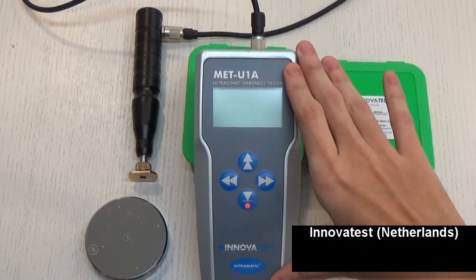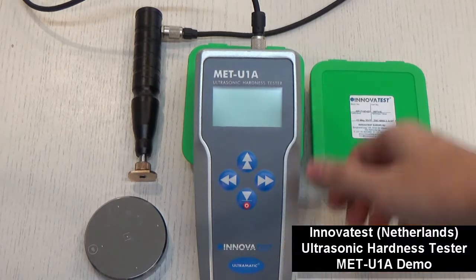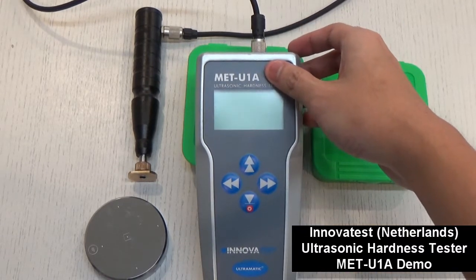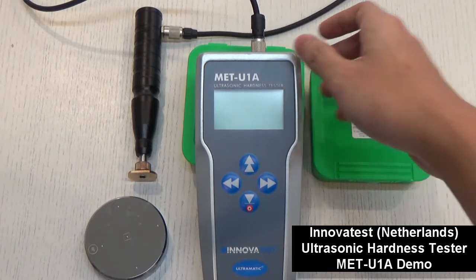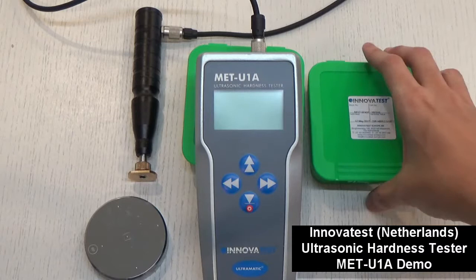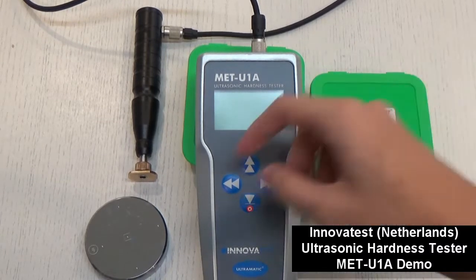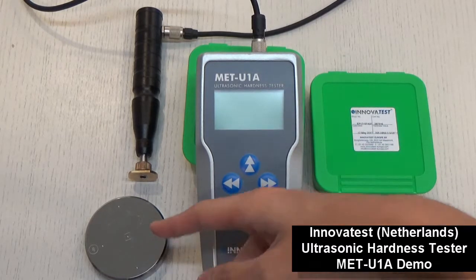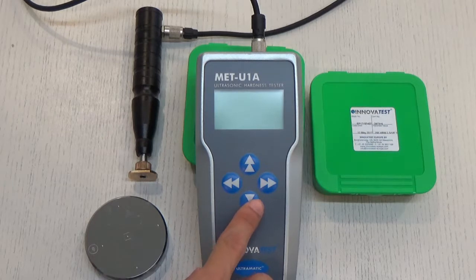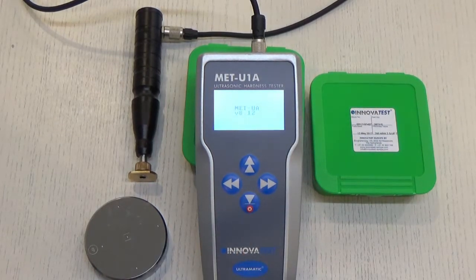Here we have this ultrasonic hardness tester from InnovaTest. The model number is METU1A. This is the ultrasonic probe, and this is the test block with its casing. The test block will be placed here. Now we can turn on the equipment.